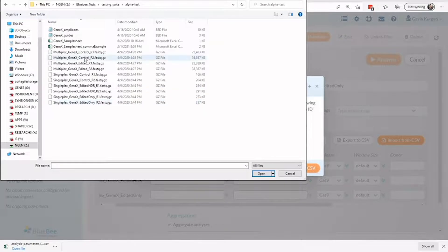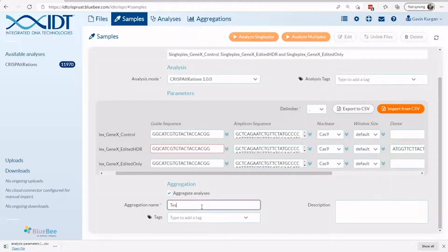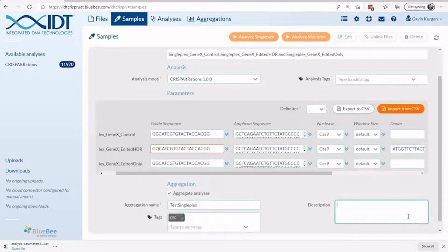From here, we can give our run an aggregated name under which all data can be summarized, add additional metadata and descriptions, and start our run.